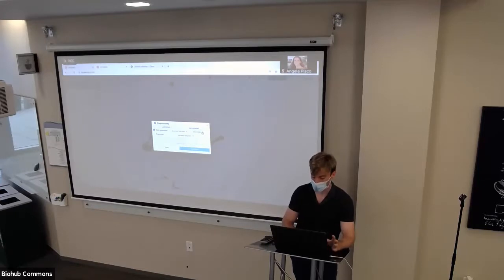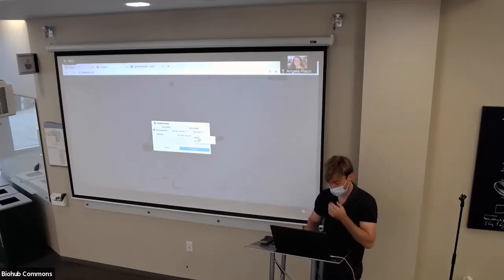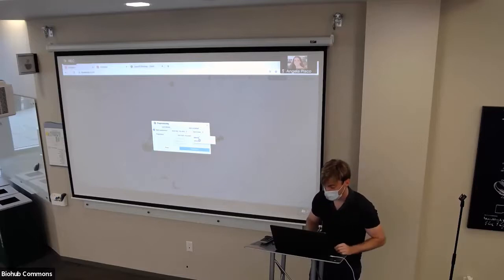And then we say, okay, for which label in my batch key do I actually want to do pre-processing? So for PBMC3K, let's say PBMC3K is already pre-processed. It's not, but let's say it is. Well, it is now, but when we load the data, it's not. And then now we can just leave this unchecked. Make sure it's unchecked because we don't want to do anything to it. Then we go to the other one, which does need some transformations. We'll click the other one, and then we'll check pre-process.